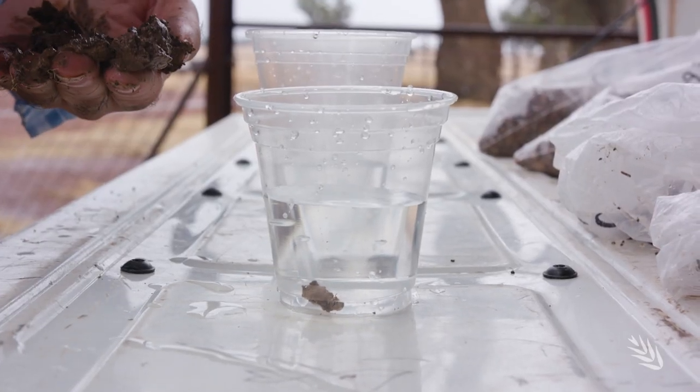A soil dispersion test will inform whether we need to apply gypsum into the paddock or not. If the soil disperses based on that test, it means that the gypsum application is most likely going to result in settlement of that soil structure and improve the soil structure. And if it doesn't disperse, it means the gypsum is probably not going to be beneficial in that situation. The technique itself is very simple.